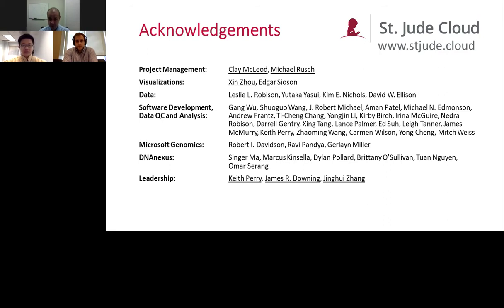Now, the other part of the story is, however, we don't suppose that there's going to be one cloud platform to rule them all. More likely, there's going to be an evolving cloud ecosystem with all of these sites talking to each other. And the really interesting thing is that DNA Nexus provides that ecosystem. There are other places like Mosaic Consortium, Precision FDA, also on DNA Nexus, and tools can move relatively freely between those subsites.